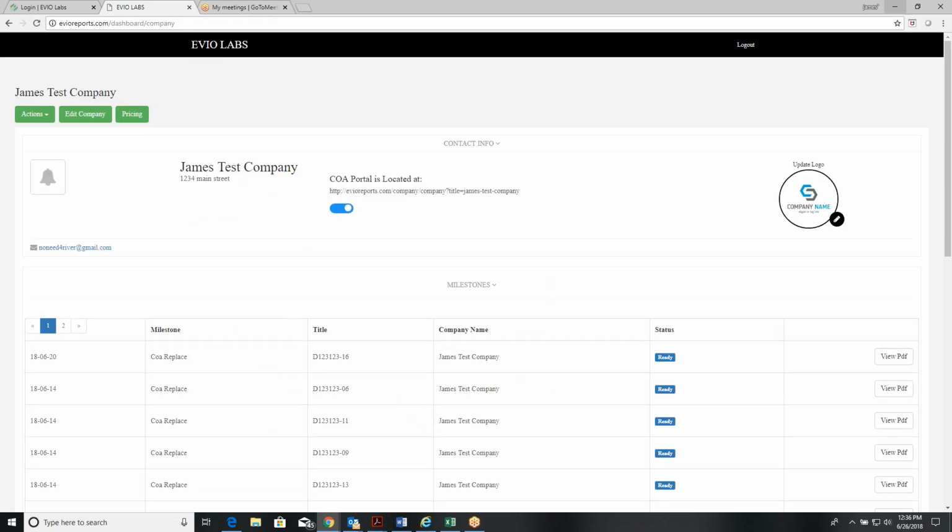So back to the home page. The main reason you'll be coming to this is to be requesting samples and/or delivery drivers. So we're going to show you how that works. Here's your following actions. You can request an update, which is asking for an update on an existing test. There's a queue of all of your COAs. This is where you'll post information. You can search for COAs from history, and then of course the sample request.